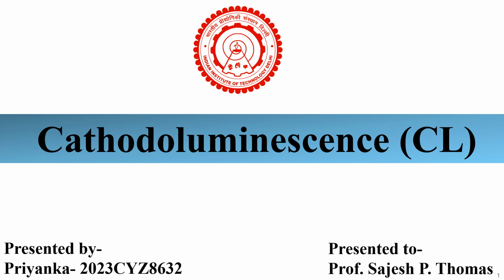Today I am going to give a presentation on cathodoluminescence, which is an important analytical technique that gives information about the spatial resolution of electron microscopy.